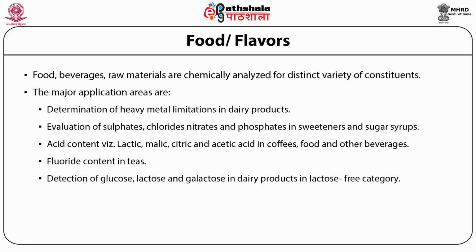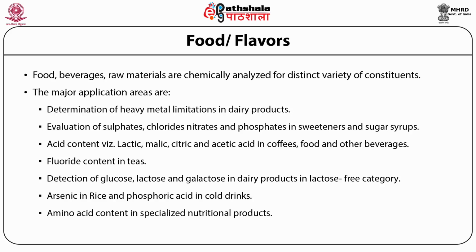Detection of glucose, lactose, and galactose in dairy products in the lactose-free category, arsenic in rice, and phosphoric acid in cold drinks, amino acid content in specialized nutritional products, presence of carbonates in drinking waters.